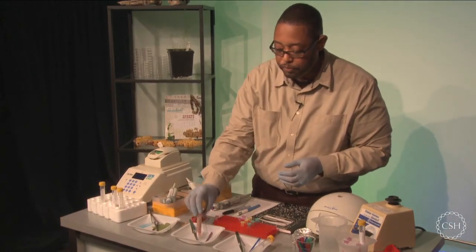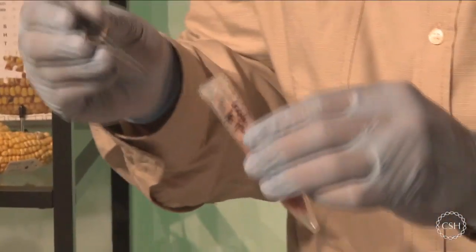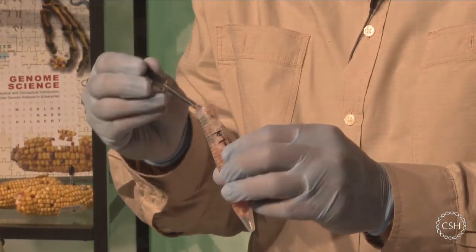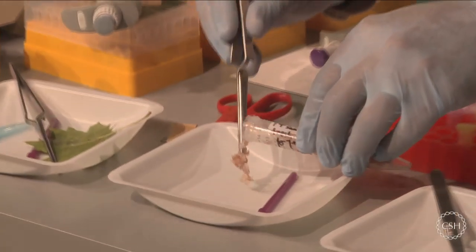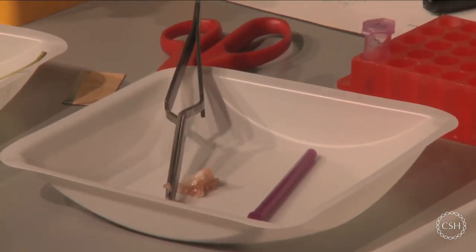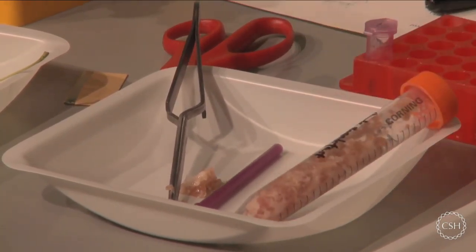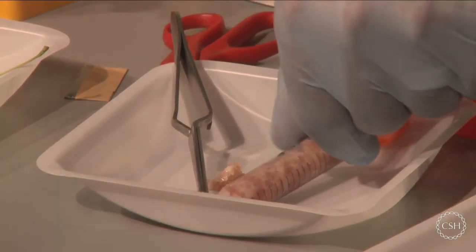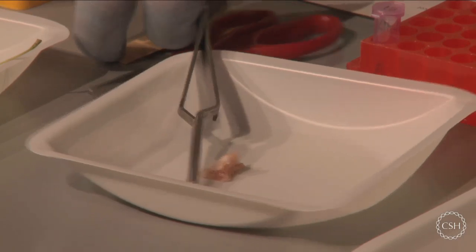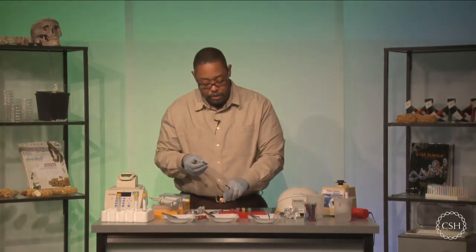Sample number 2 is some meat, and this is actually, I believe, some pork. All I want to do is show you how much of the sample you should physically have when you go in here. I'm just going to pull out a little bit of this. As you can see, depending on the type of meat that you choose here, whether it be beef, steak, or fish, it'll come out in a different manner. But what I want you to get into the habit of is noticing that this material needs to be only about a quarter of the size of an eraser. So we don't want to take too much material.